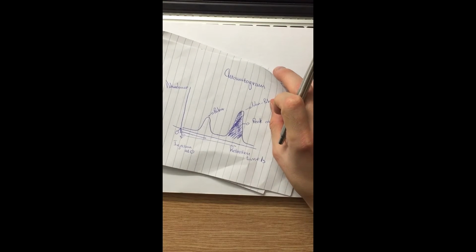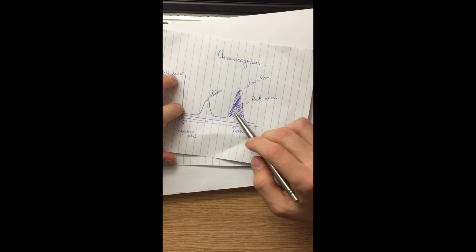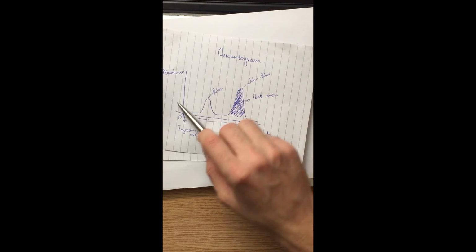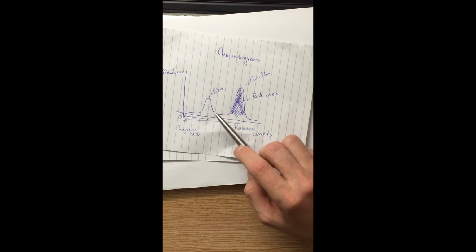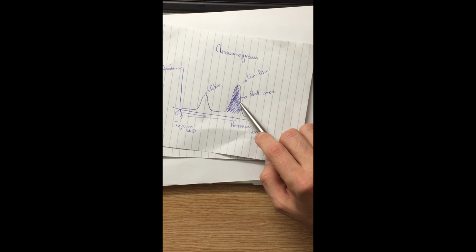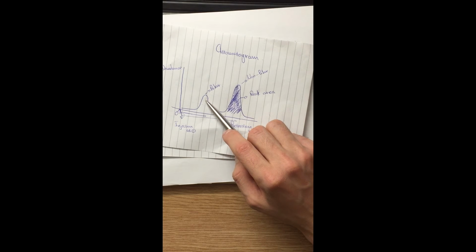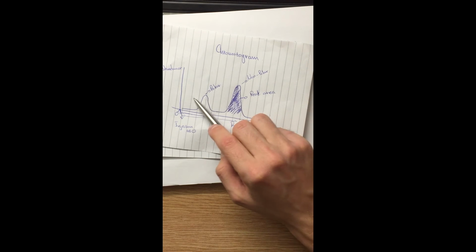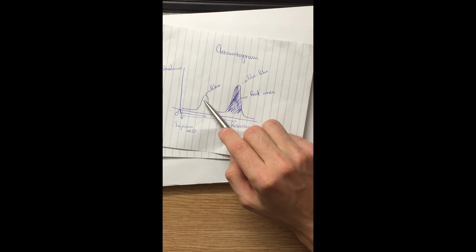So we can see the 2 peaks in this graph called a chromatogram. This is the graph of abundance over retention time. If we analyze the graph, we can find that the non-polar gas represents the highest peak, whereas the polar gas represents the peak with the smallest height. I also want to mention that the area in these peaks represents a concentration of each gas in the mixture.